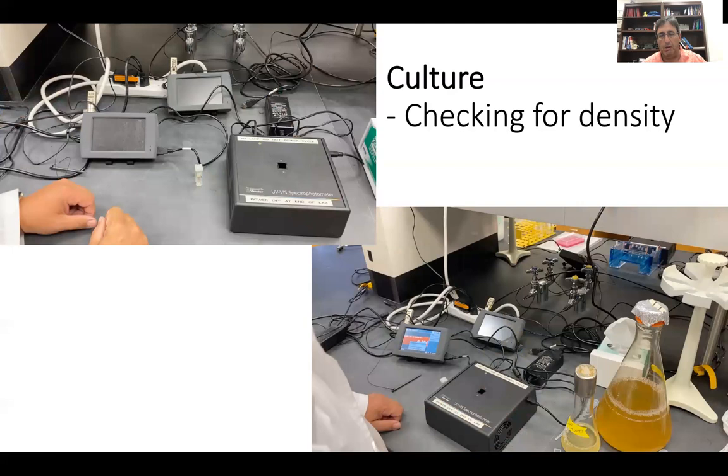All right, so depending upon the lab you're working in here at USD, we have the verniers, and sometimes they'll be set up near the shakers. Other times you may have to go back to the lab. So for those who have verniers, here's how you can start checking your optical density using the vernier spectrophotometers.